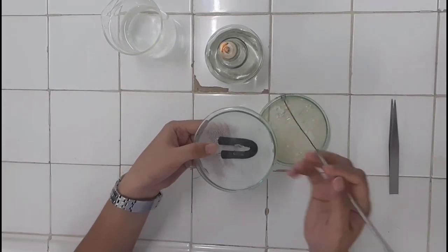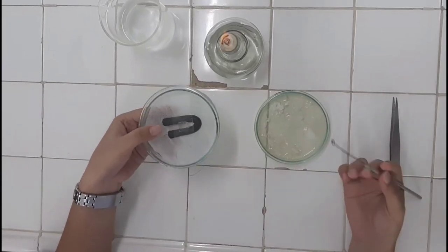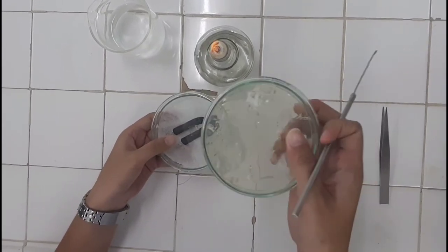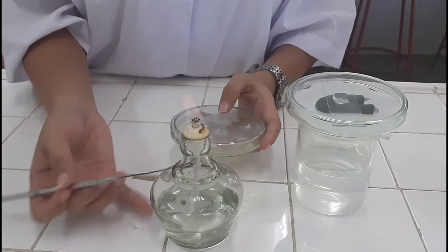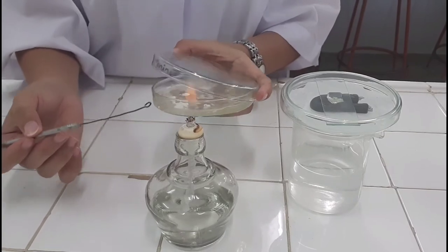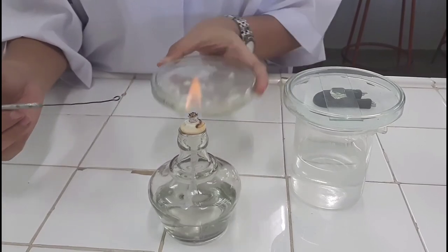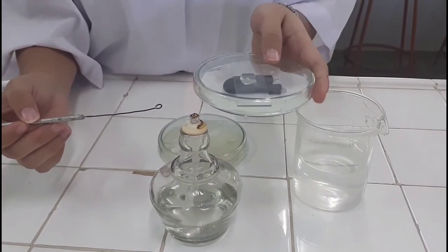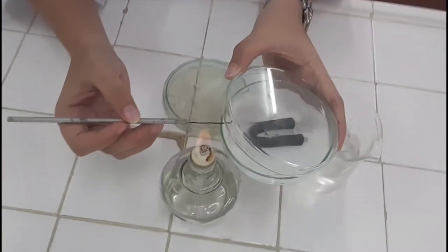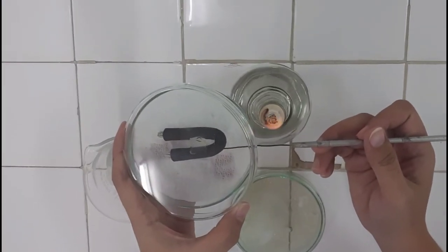Prepare the mold culture to inoculate the four cut surfaces of each block with a piece of mold growth. Aseptically inoculate a mold culture. Put it slowly to the side of the block. Each block should be inoculated with a culture.